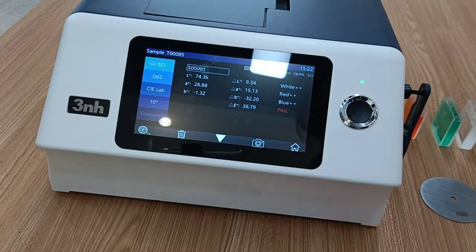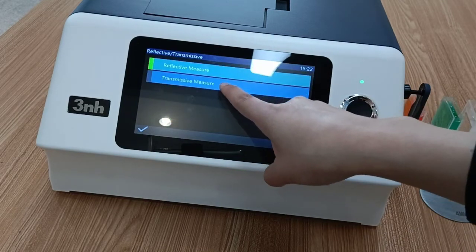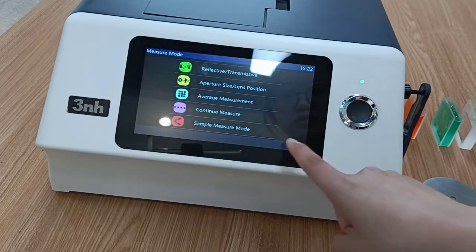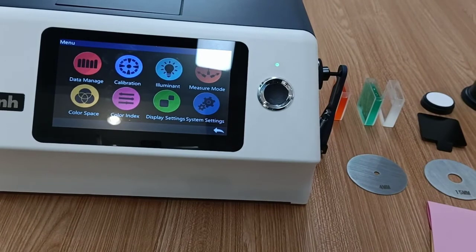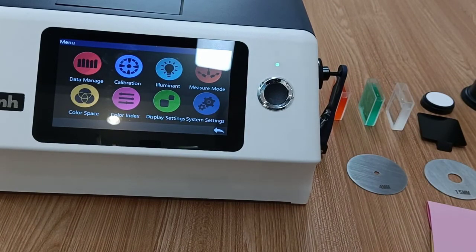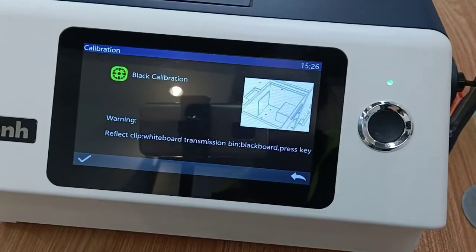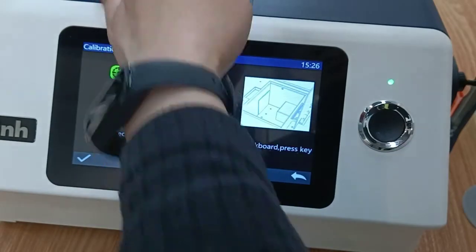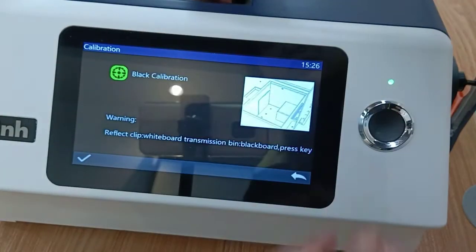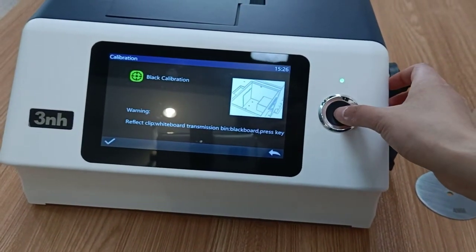Then we set the measure mode to transmissive measure. For example, to test some liquid. We need to do the calibration again — for the transmission beam, we put in the black board and press the measuring key.